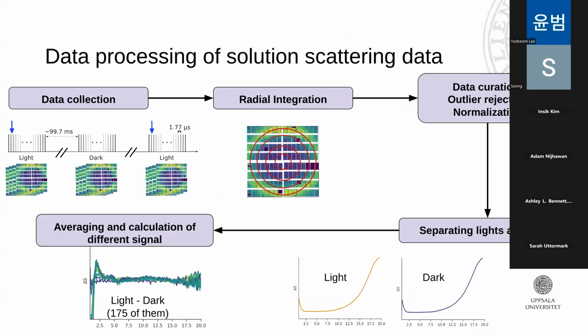For the data collection, we were collecting interchangeably one light, one dark, one light, one dark. We did this because we wanted to keep any possible systematic errors within the train consistent throughout. So if, for example, we have a certain shot noise at the fifth pulse, we know that is consistent always in the fifth pulse, so we will have it in both the dark and the light.